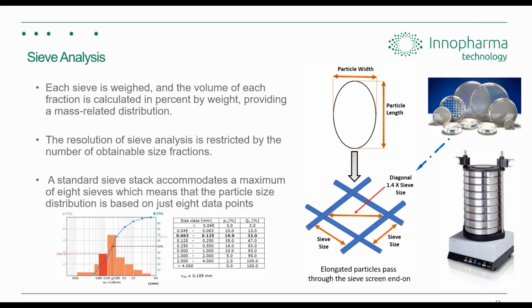You're actually binning different particle sizes onto those sieves. But that has its drawbacks for a few reasons. One could be your sieves could be damaged, but you can also get them certified. The other main one is, as you can see from this image, when the particles are shaken on the sieve, what happens is the smallest diameter or the smallest chord length on that particle is what will fall through that aperture. So if you have a very elongated particle, which we're showing here, it's going to fall through that sieve and give you maybe a bit of a misrepresentative result of what the actual volume is of that particle. It's just the smallest one that fell through. But again, it's the standard method.